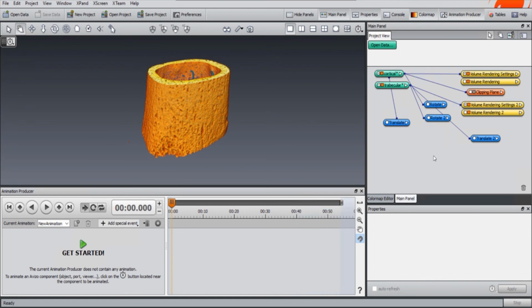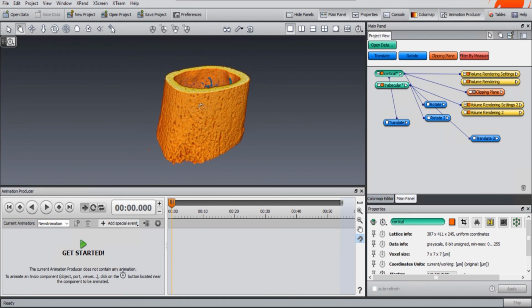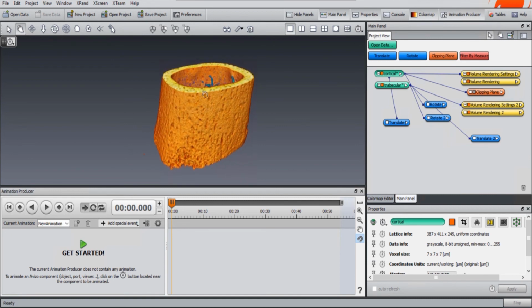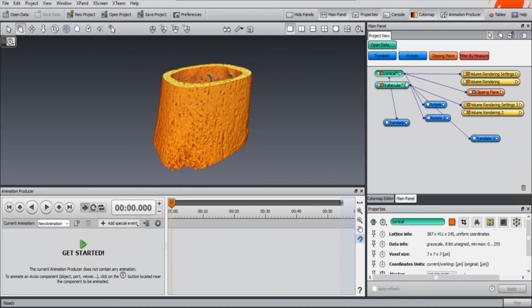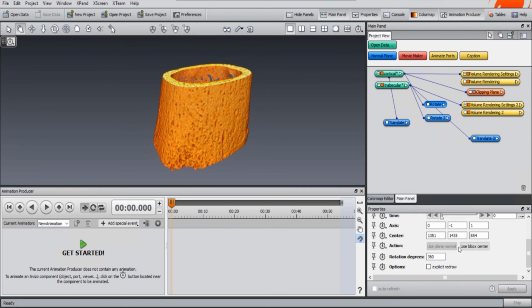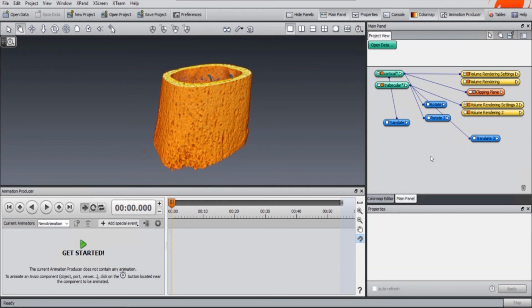So in my video, the first thing I'm going to do is, position your sample, your object, the two objects where you want to start. So I'm going to position more or less like this. I hope it works. The first thing I want to do is the rotation. So I want both of them to rotate together so that it doesn't seem that I have two different objects. I want to show just one thing.